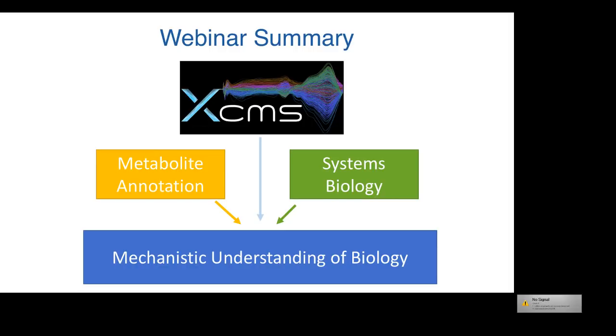since the software has so many different metabolites that it has to choose from, how does it find out which is the correct one for the pathway? That's a great question. So I'll give a short explanation, and then I'll let the guys chime in if they have a more computational answer. Whenever you're making a metabolite identification or annotation assignment, and in metabolomics I've learned recently, there are standards and levels for the identifications, and you can use different pieces of information to help you sort out the answer.